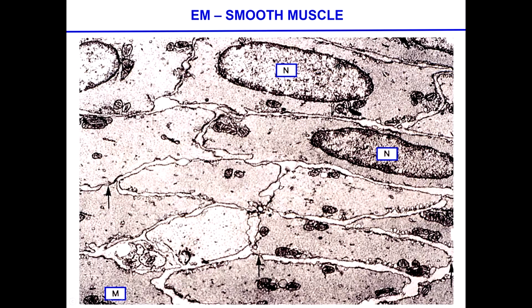Same thing. It is important to see that there are cells that are also some of those reticular cells I've been talking about. Some of the mitochondria, the nuclei are located in the right portion, and some of the gap junctions that exist between the cells allow the communication and transmission of signals from one source to the neighbors. Questions? The arrows are pointing. I could have used this as an example of gap junction. There's another one on the other side.